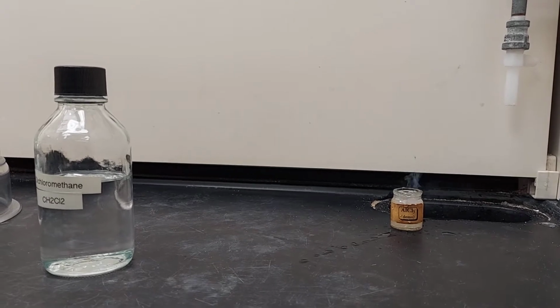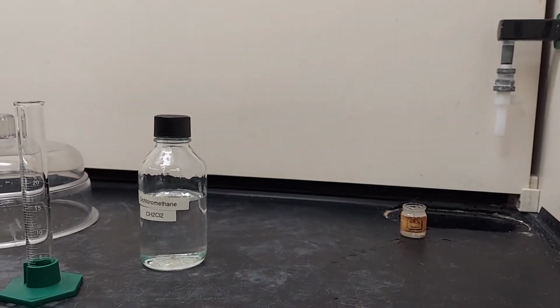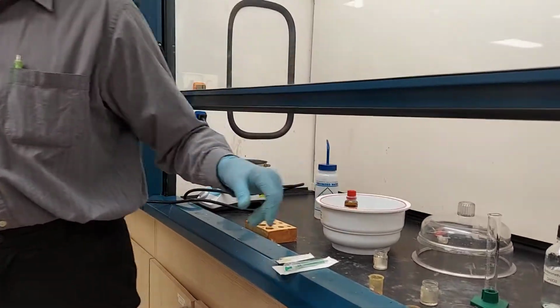Oh my goodness, what is that? There's white smoke coming off of there. That's hydrochloric acid. You don't want to be breathing that. So very dangerous catalyst.